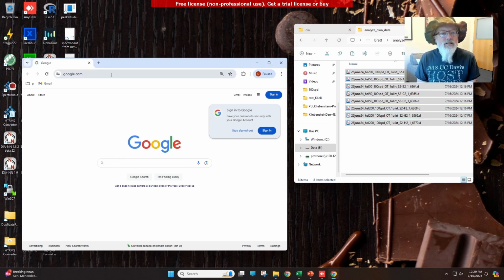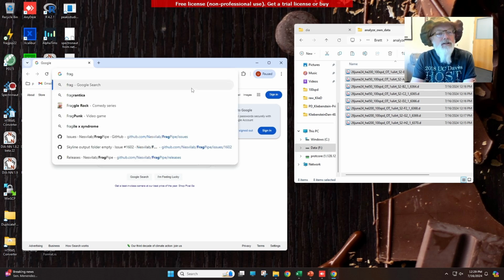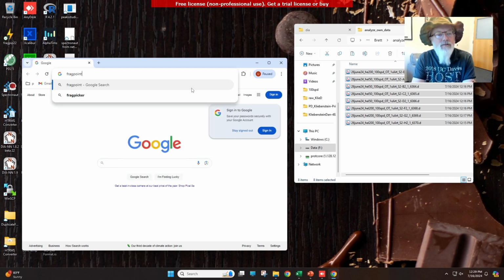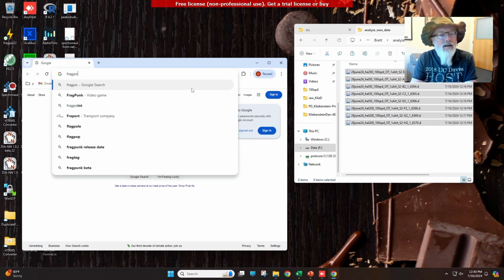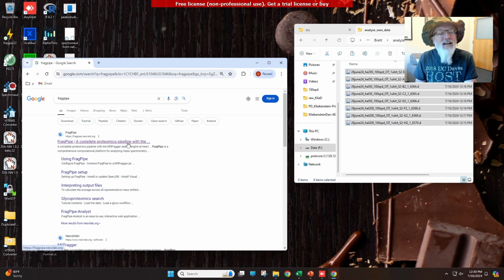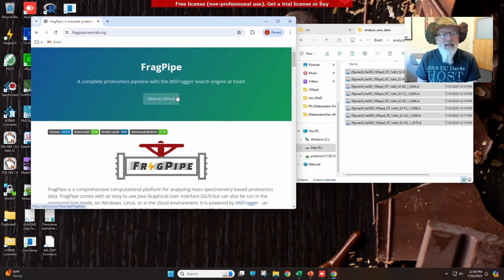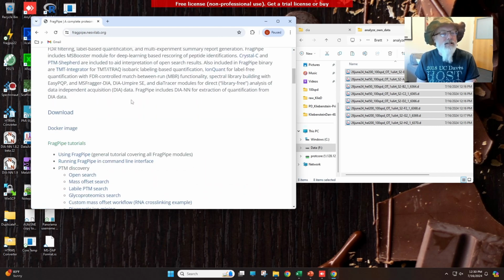Okay. So we're first going to look at the new version of FragPipe, which is not really open source, but a free software for academics that you can use to analyze your data. All you have to do is Google search FragPipe, and you will see a nice link at the top that's download. So you click download.